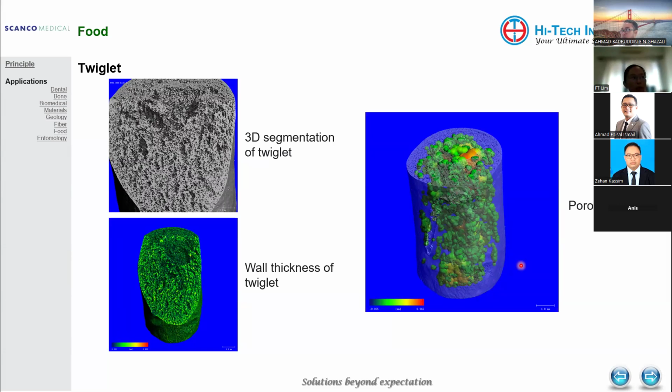One of the samples that I have come across is the bread. So this group of researchers would like to see what kind of bread, after being chewed a number of times, shows changes in softness.